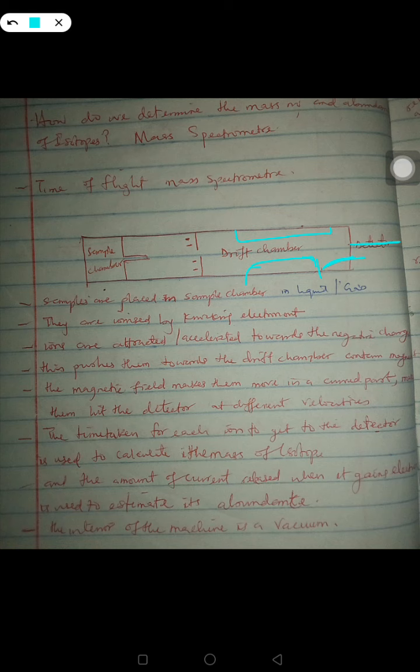Immediately the charged particles from the sample have escaped the negative charge and enter into the drift chamber, they will start moving across the magnetic field. When charged particles, ions, move across a magnetic field, they move in a curved path.